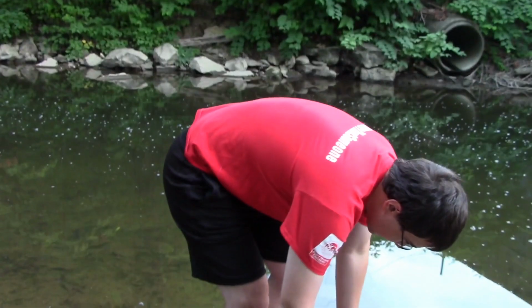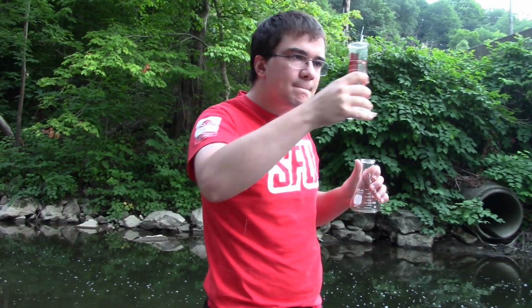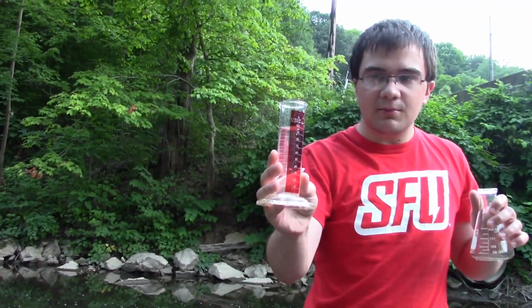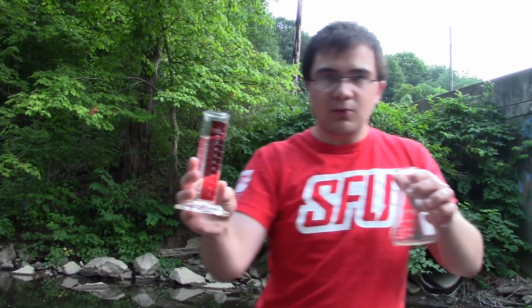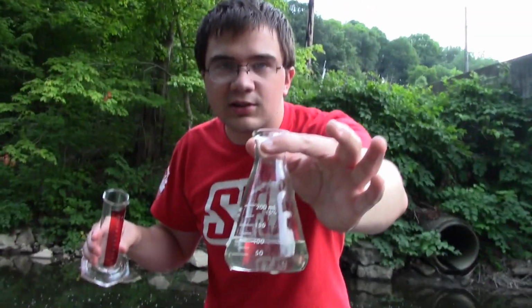Here we are at Abers Creek with the Hawk Alkalinity Test Kit. The first thing we're going to do is rinse these out 3 times. Next, I collected 100 milliliters of sample. Pretty good. Alright, now I'm going to pour this into the Erlenmeyer flask. And now we have pretty accurately 100 milliliters.